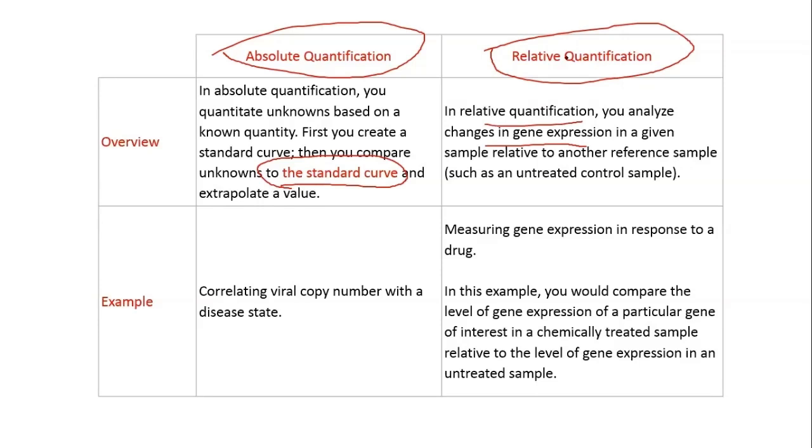Relative quantification is usually done for checking the expression of a gene in sample A and sample B. You can tell how much mRNA has been transcribed from gene A in sample A, and how much mRNA of gene A is present in sample B. And you are using a control sample here, between the two samples you're checking, and thereby you are using an endogenous control.